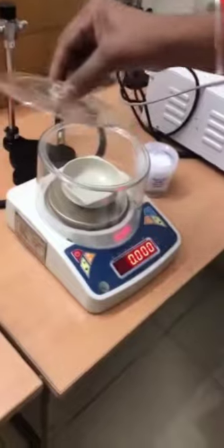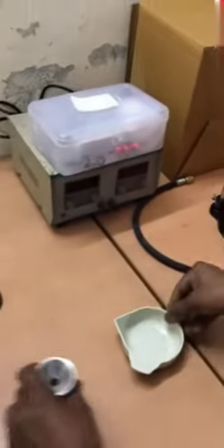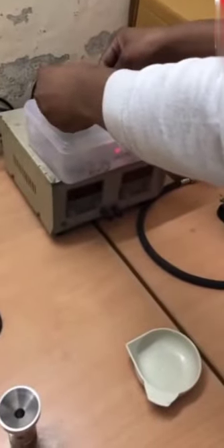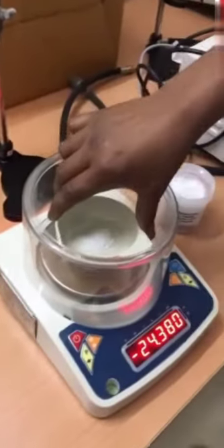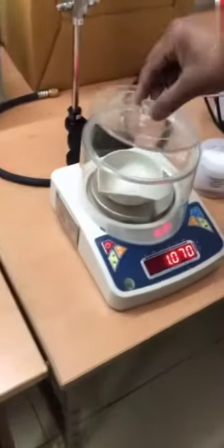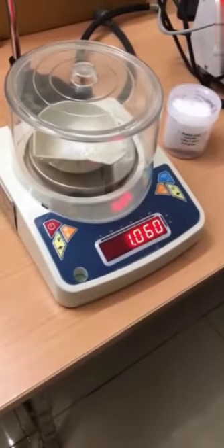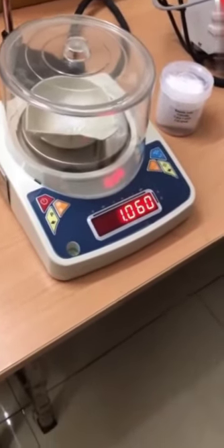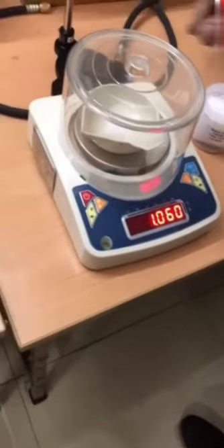First, we will show how to make a pellet of the sample. This is a green pellet — we take benzoic acid. We have already taken this benzoic acid, already wetted. Now I will put it in the weight box and close it. The weight is 1.060. So what I am showing here is: always take this measured value of benzoic acid, and take this value for making the pellet. The weight is 1.060.